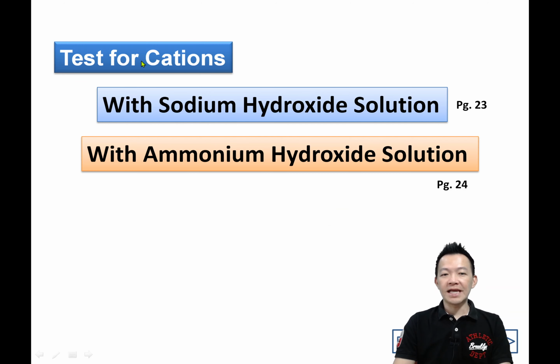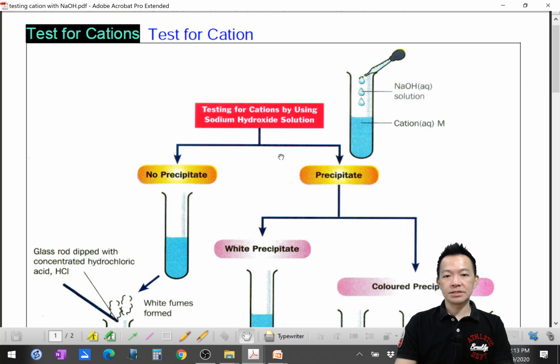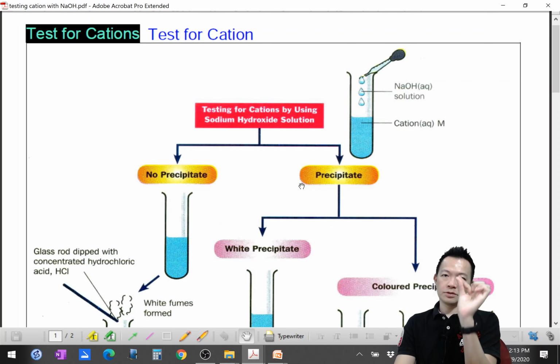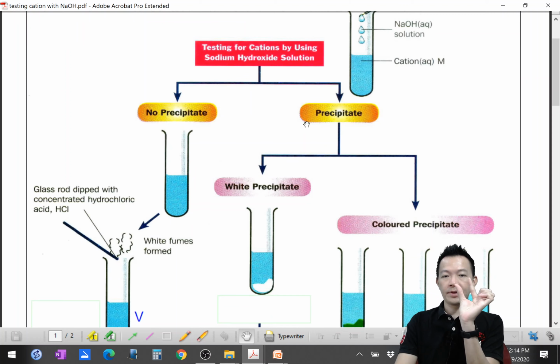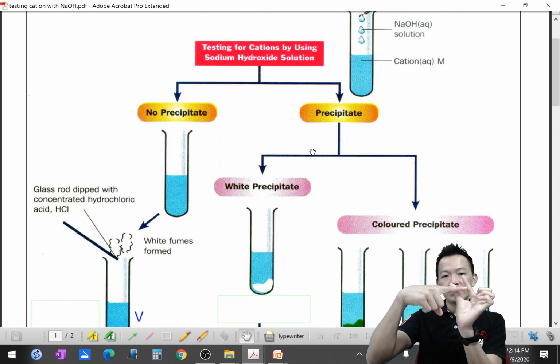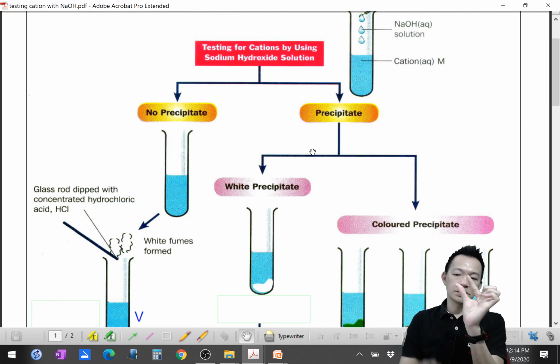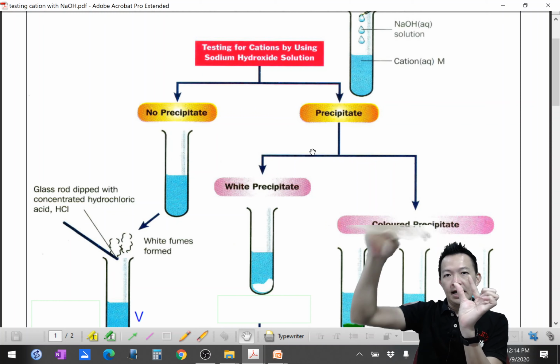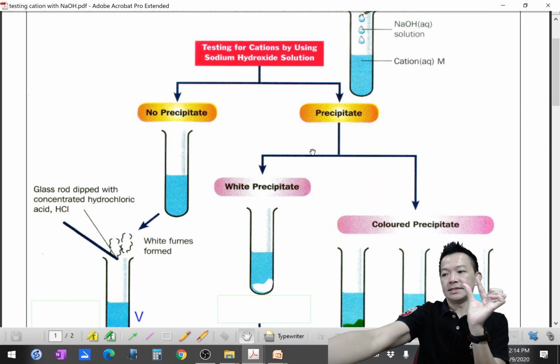Okay, so that's a cation with sodium hydroxide solutions. Okay, and page number 23, start now. So now let's say I'm having the salt solutions in the test tube. I want to confirm the cation inside the salt solution. What's the ingredient? The cation, what is the ion added? So the first test, I add sodium hydroxide. I add a few drops of sodium hydroxide.